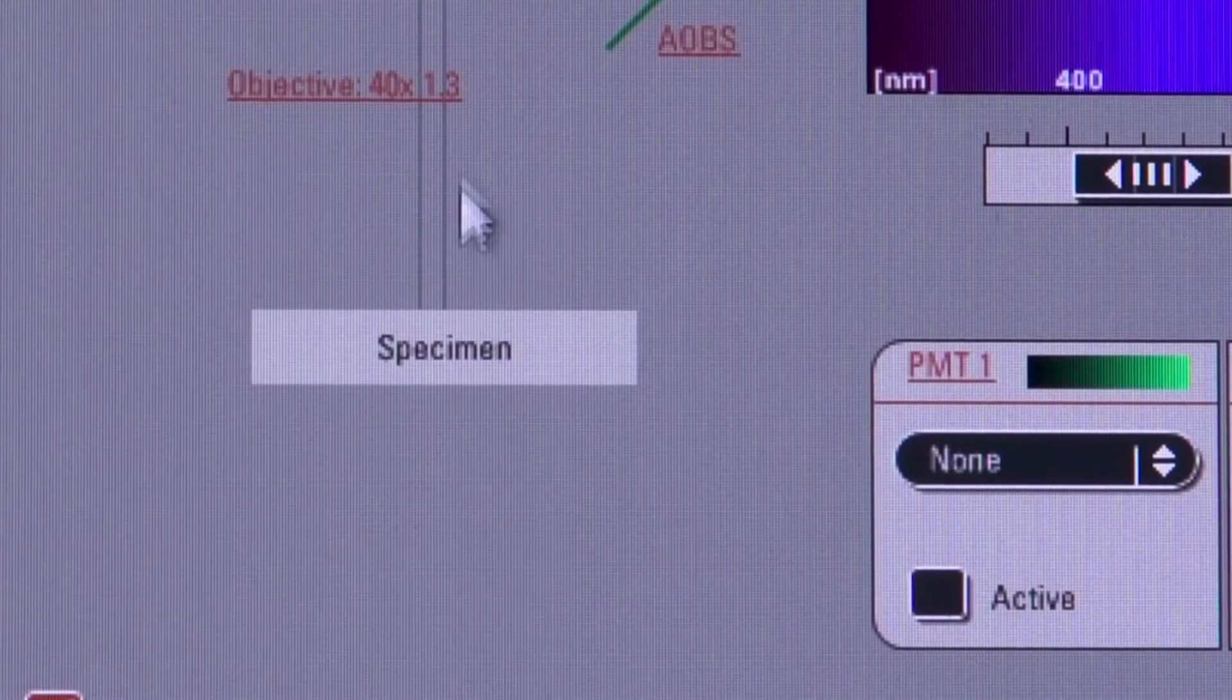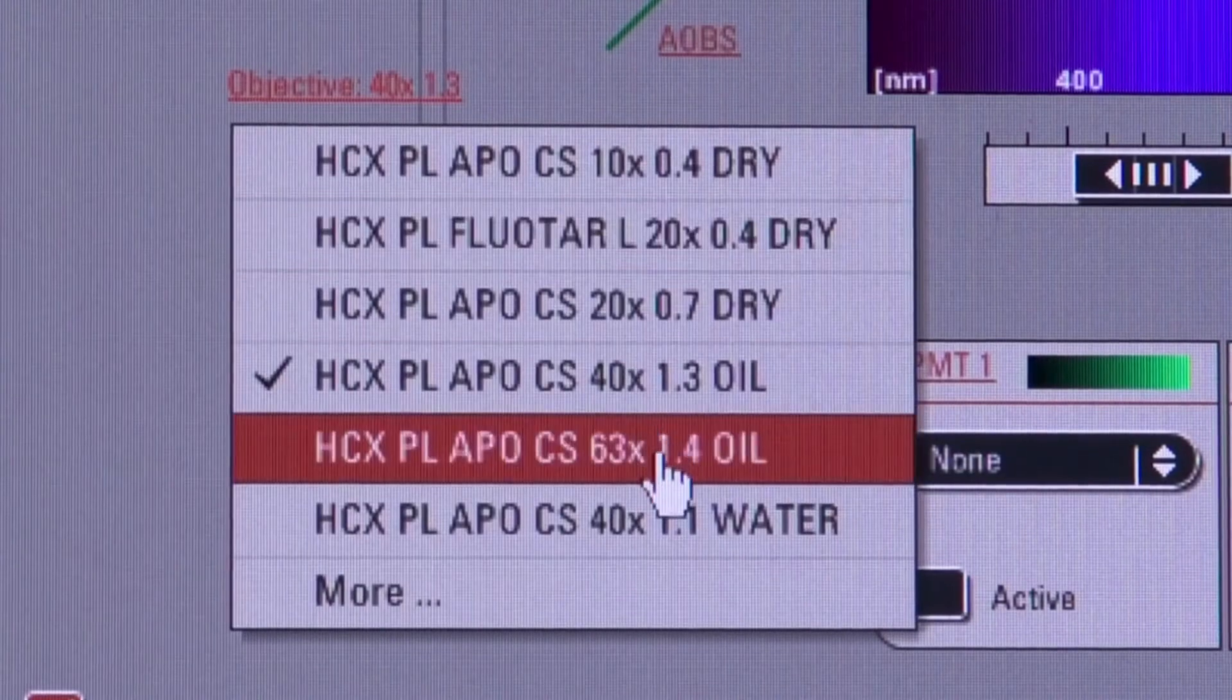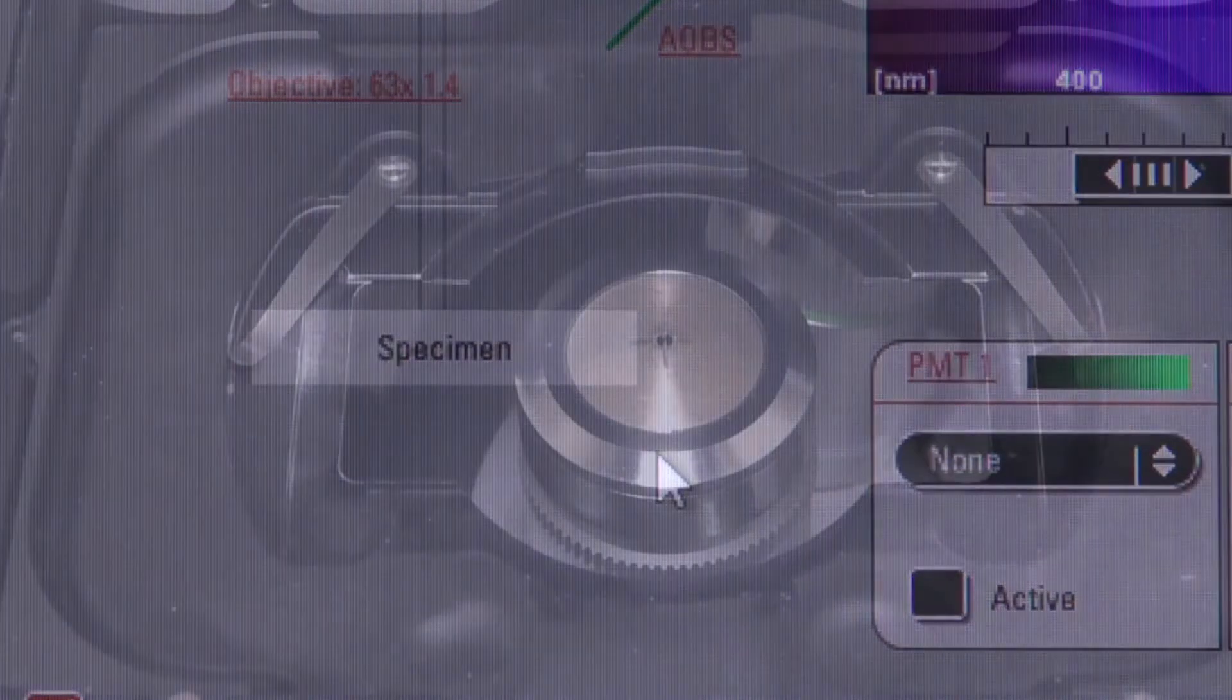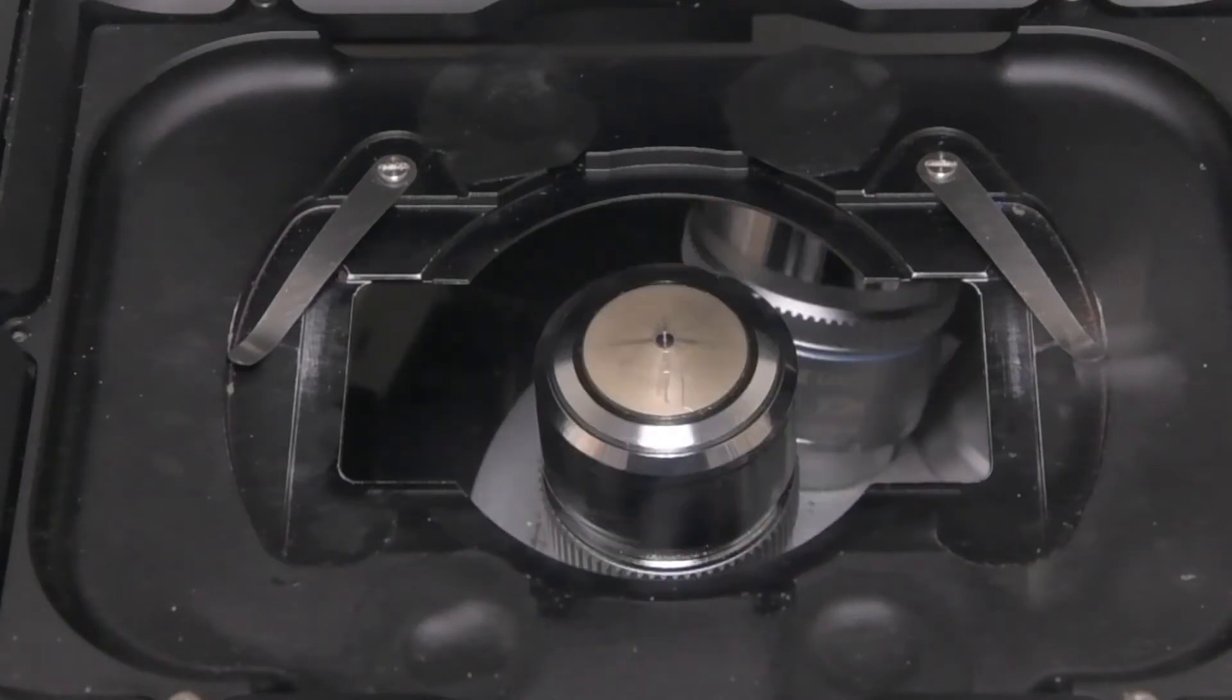So back to the task at hand. We want the 63X, so let's click on that and see what it looks like in the scope. Here is the 63X objective in place. It looks a lot like the 40X, but it's a little thinner.